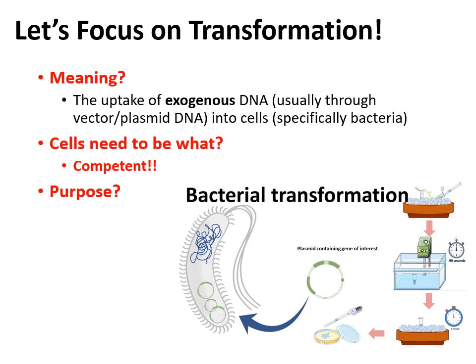We basically have you do transformation quite a few times because that's one of the experiments that you really have to get a good grasp on, what it means, why we do it, how to do it, because you end up using it so much no matter which field in science you go into.